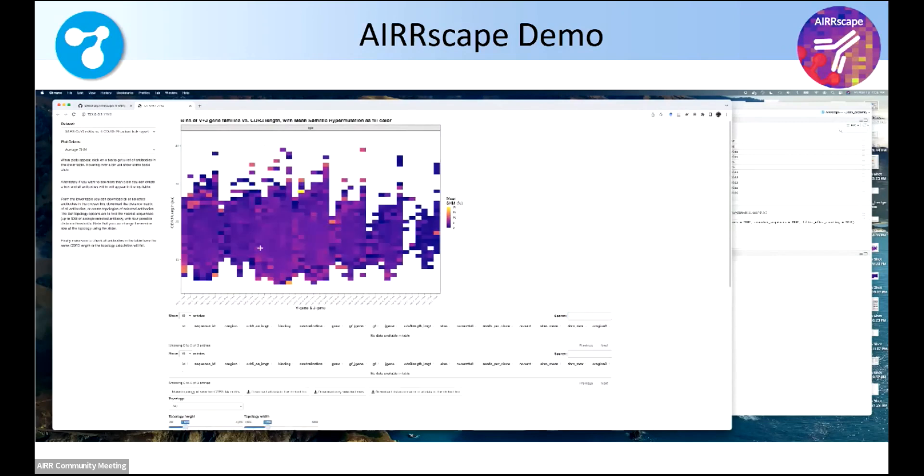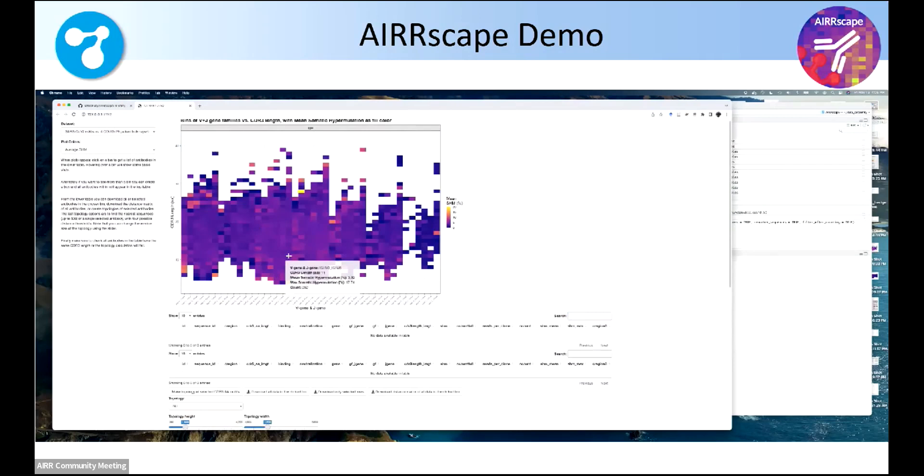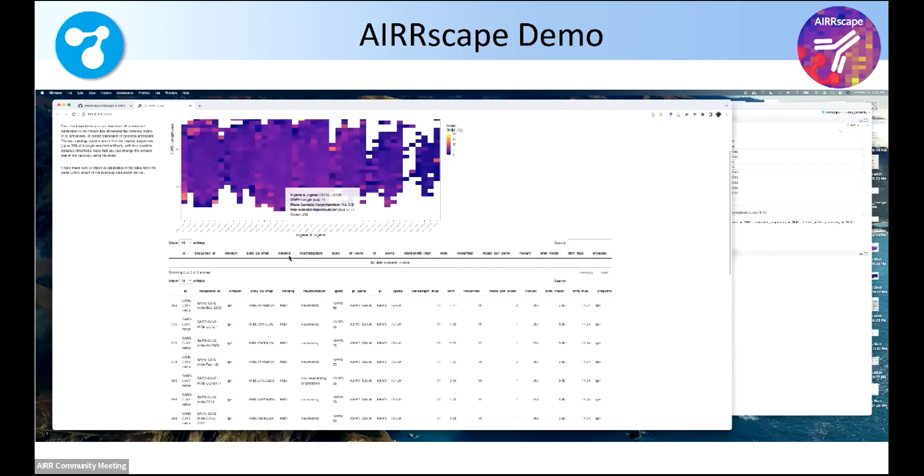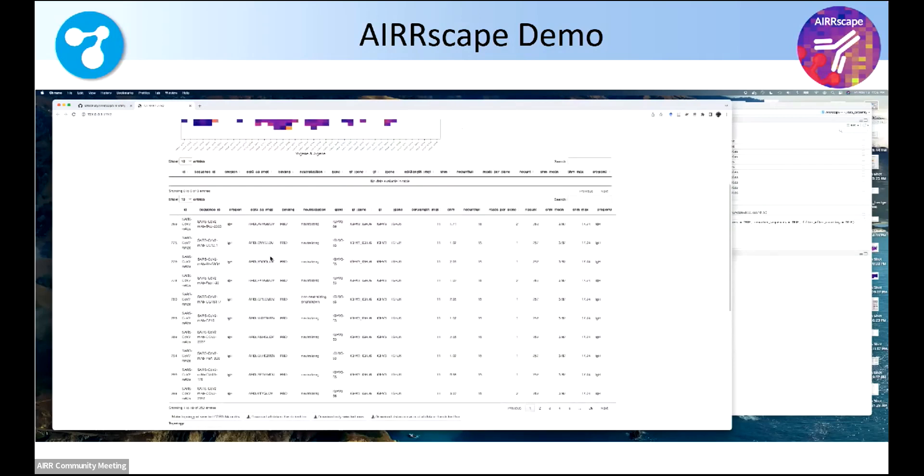So now I can go into the large heat map and hover over 3611, click through. Now we have all of those. In this particular case, there's about 250 individual sequences with that in that bin.